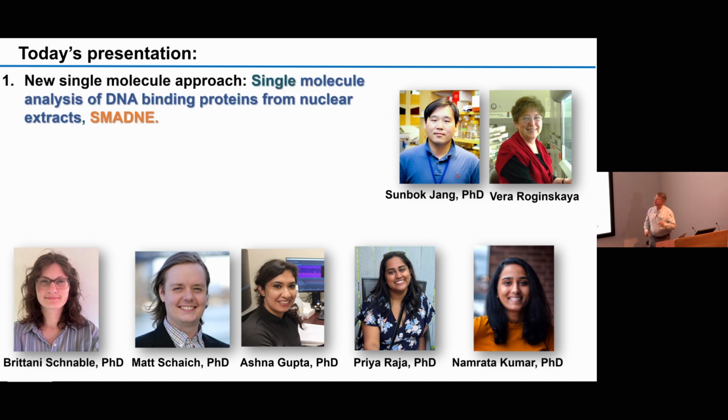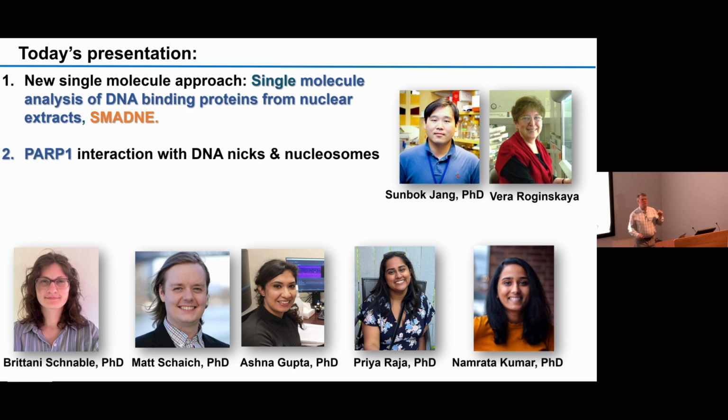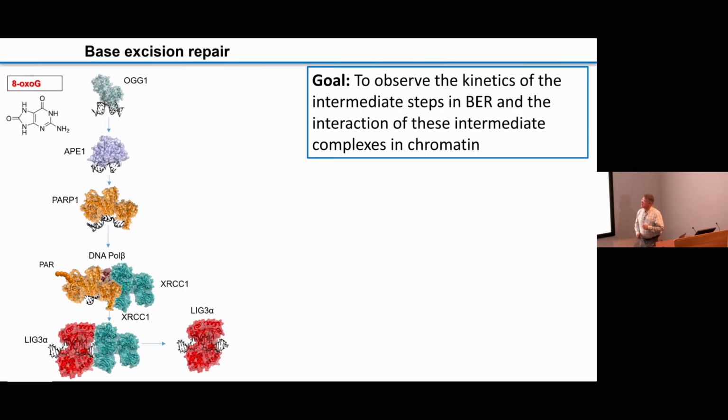So I'm going to tell you about how we can watch fluorescently tagged proteins from nuclear extracts on the C-trap. And we've named this approach SMADNE. And I'm going to pick one example to show you the power of this tool. So this is base excision repair.